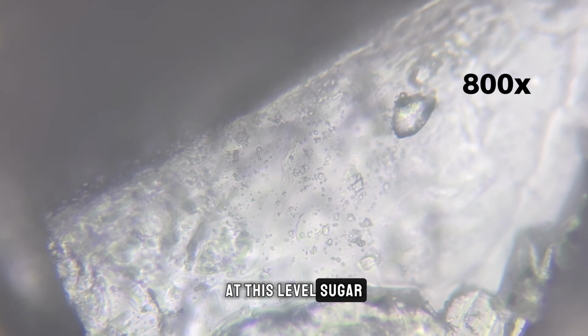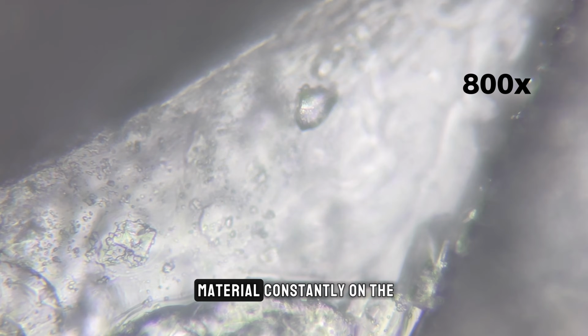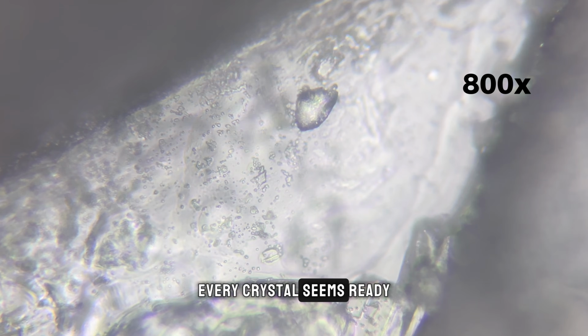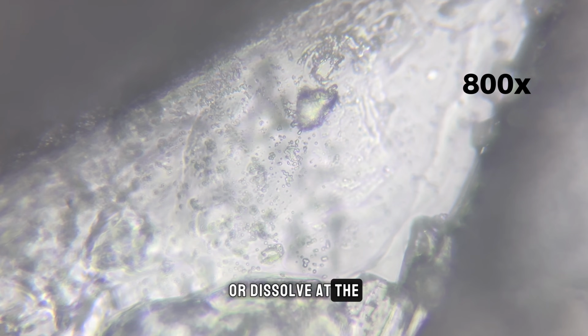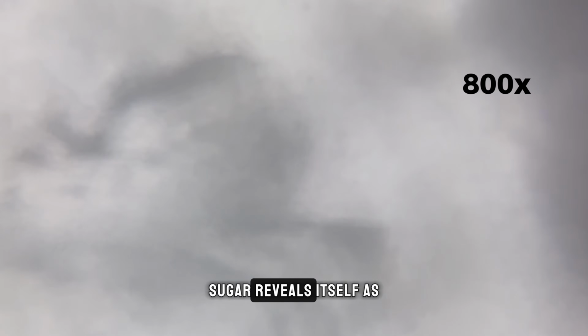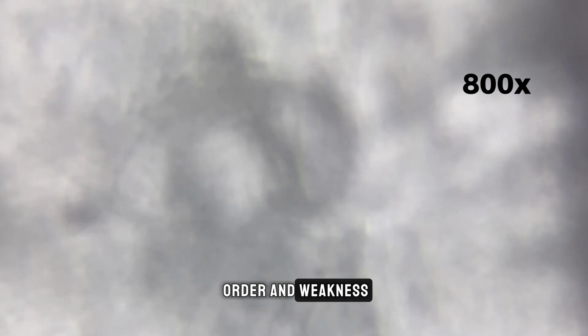At this level, sugar no longer feels simple or pure. It looks like a material constantly on the edge of collapse. Every crystal seems ready to shatter or dissolve at the slightest disturbance. This magnification explains how something that looks hard can disappear so quickly in water. Sugar reveals itself as a delicate balance between order and weakness.